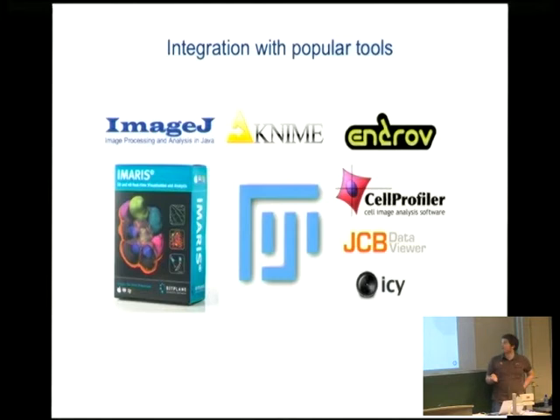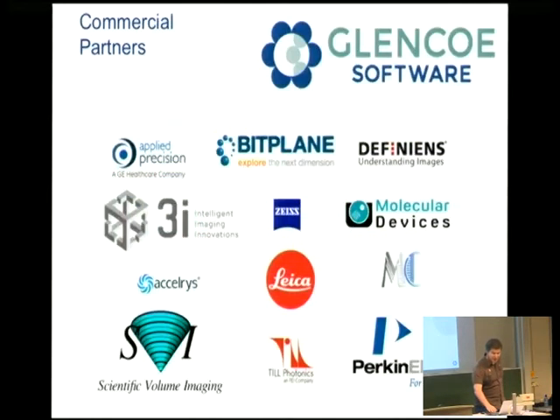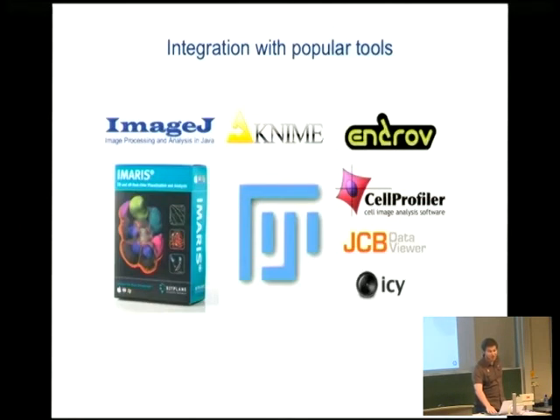So there are tons and tons of tools in image analysis, for various tasks to do with images and other microscopy measurements. Up until this point, a lot of them would only work with some image formats. But as time goes on, and we can import more image formats into our OME-XML, if the projects then pick up OME-XML as one of their supported formats, then you get a big win there for free. So you start to be able to use the best tool for the job rather than being dictated to by whatever image format you happen to have.